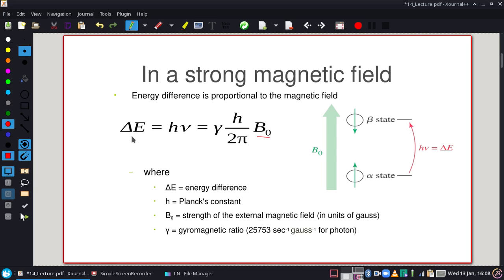And we find something neat. If I actually stop and back up and look at what the frequency is, we find that an electromagnet, or a slightly larger magnet than what we find in, say, a refrigerator magnet, the frequency is in the megahertz range. So this frequency is in the radio wave range.